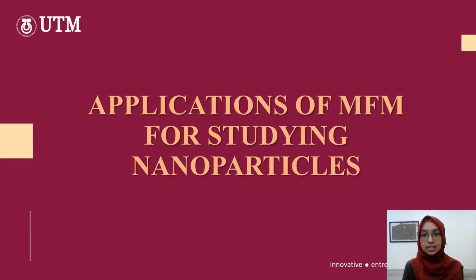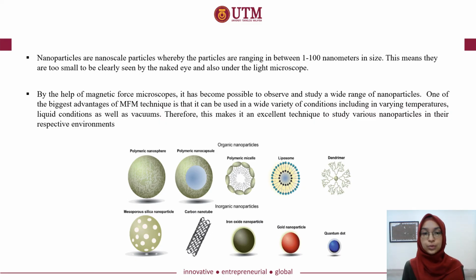Last but not least, here is the application of MFM for studying nanoparticles. As we know, nanoparticles are nanoscale particles, which means that the particles range between 1 to 100 nanometers in size. This means they are too small to be clearly seen by the naked eye and also under the light microscope.